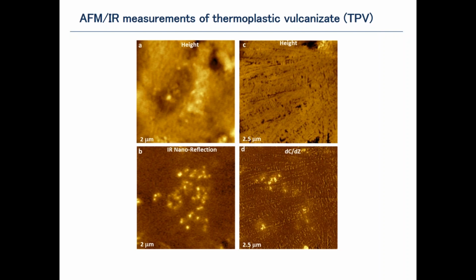It is, by the way, confirmed by other techniques, for example, capacitance microscopy, where because of different dielectric coefficients of these materials, we can see these bright parts in the image.